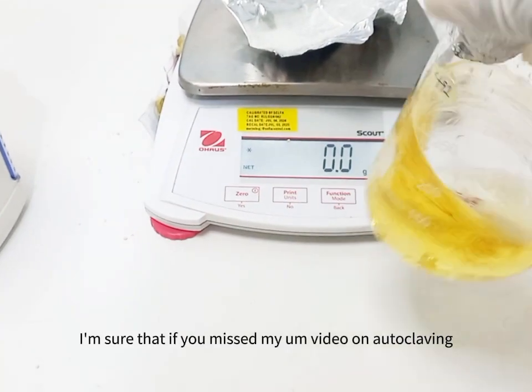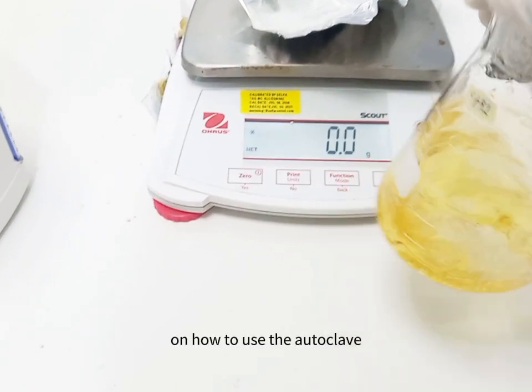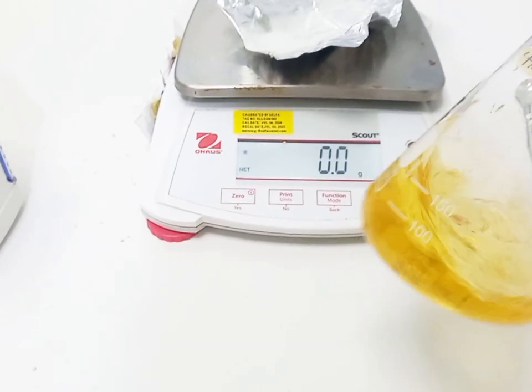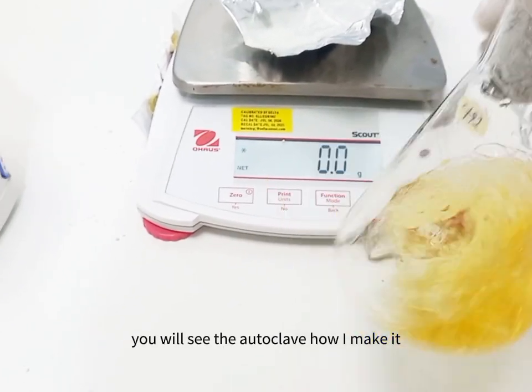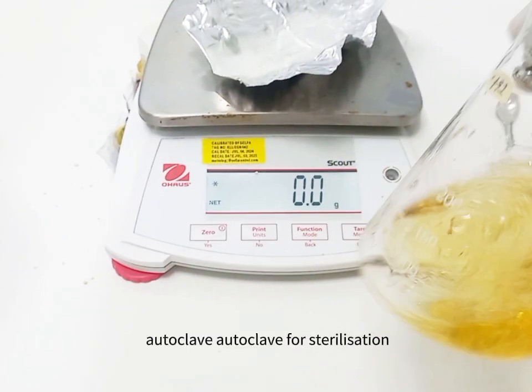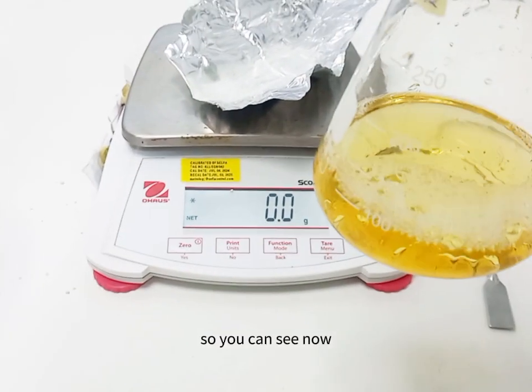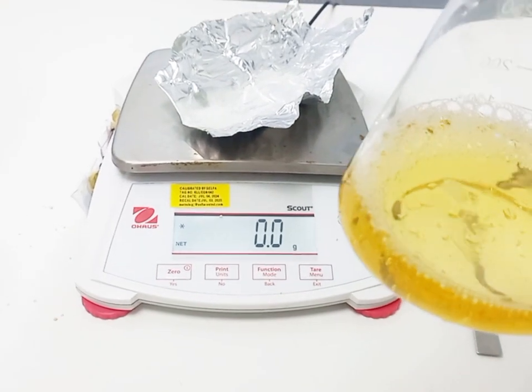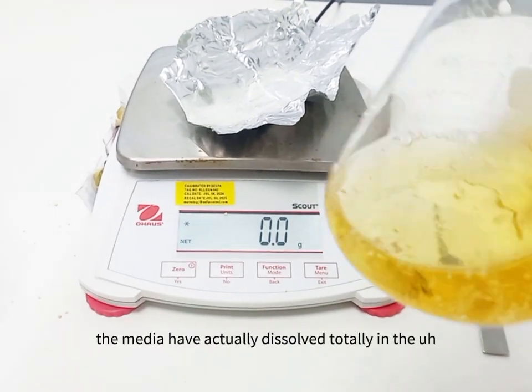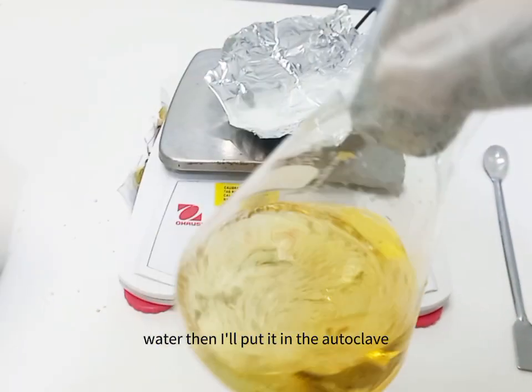I'm sure that if you missed my video on autoclaving, on how to use the autoclave, you can go to my videos. You will see how I make use of the autoclave for sterilization and for preparation of your media. So you can see now, I don't know if you can see the bubbles, they are showing that the media have actually dissolved totally in the water. Then I'll put it in the autoclave.